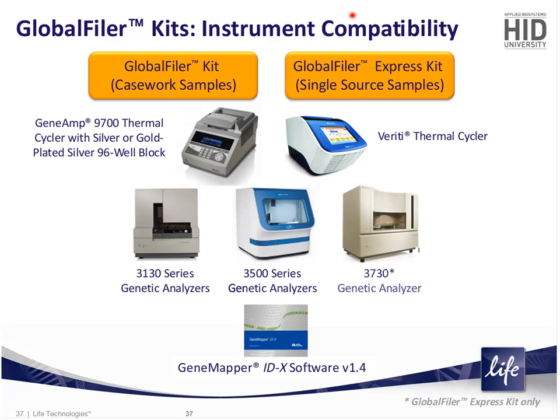So we have enabled 6-dye capability on the 3130 series and the 3730 genetic analyzer. Just a small note, the 3730 genetic analyzer is currently only validated for the Identifiler kit for single source samples, and it's only on the 48 capillary instrument, not the 96. This is the same now for the GlobalFiler Express kit, so it's only the GlobalFiler Express kit which has been validated on the 3730 platform. We do not support the analysis of the GlobalFiler kit for casework on that instrument platform. But for the 3130 series and 3500 series genetic analyzers, both GlobalFiler kits will be supported on these platforms.